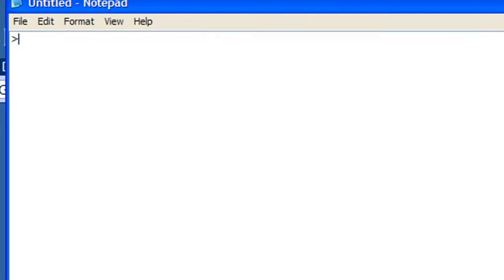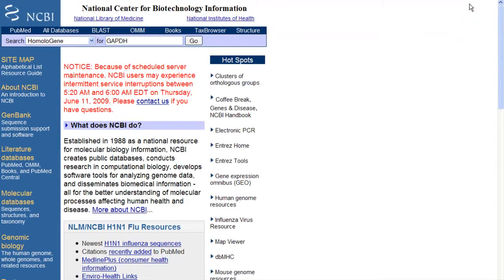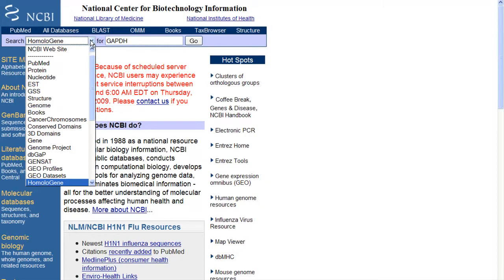So I'm going to go ahead and clear this out, and we're going to go to the National Center for Biotechnology Information. Here's the link. It's publicly available. This is a database of all sorts of wonderful things. I swear I could spend weeks here just browsing through the information. For example, if you want to look at all the H1N1 influenza sequences that have been isolated. Lots of databases can be searched here.